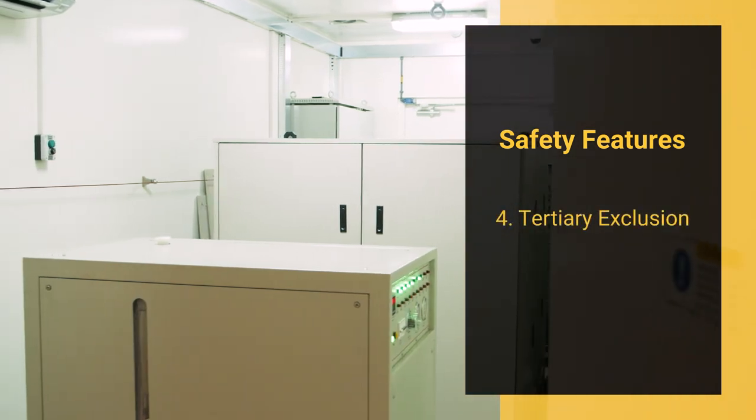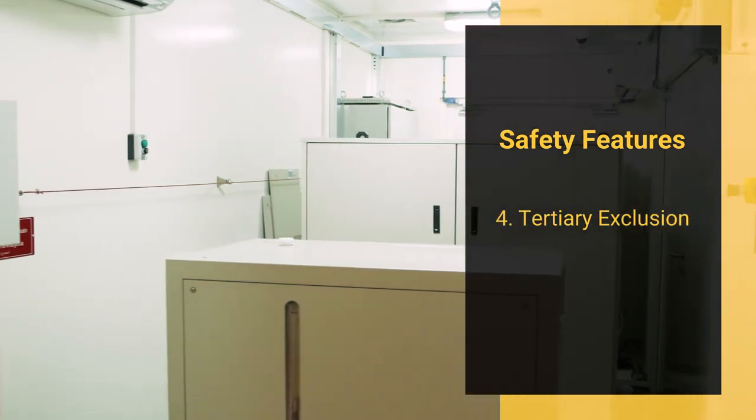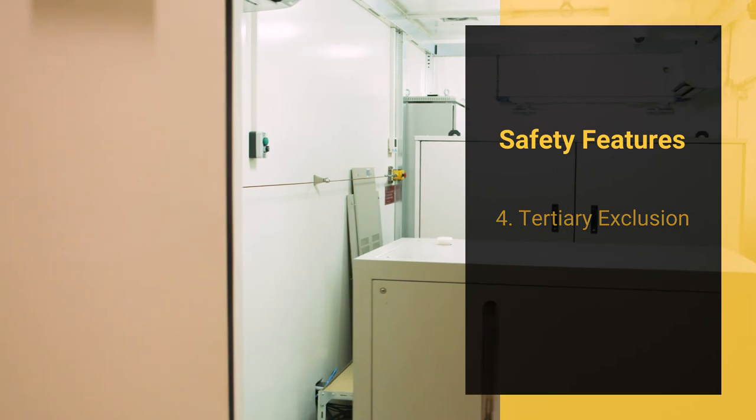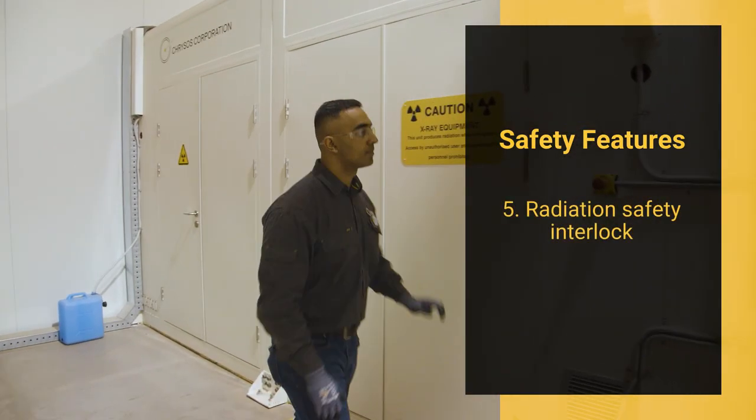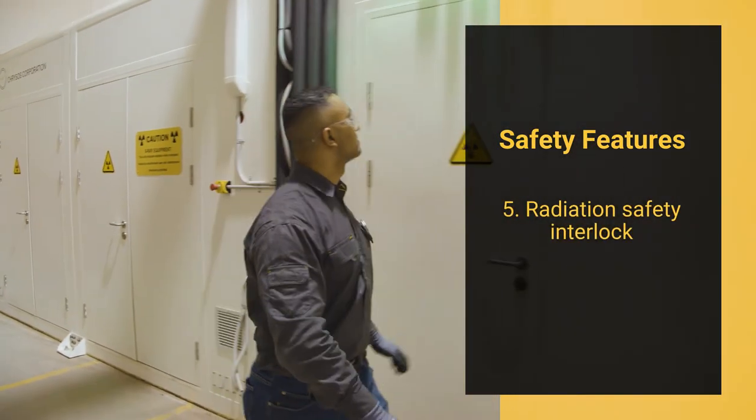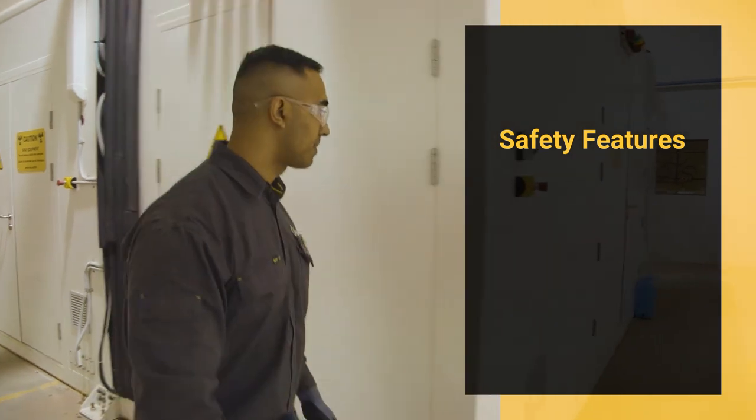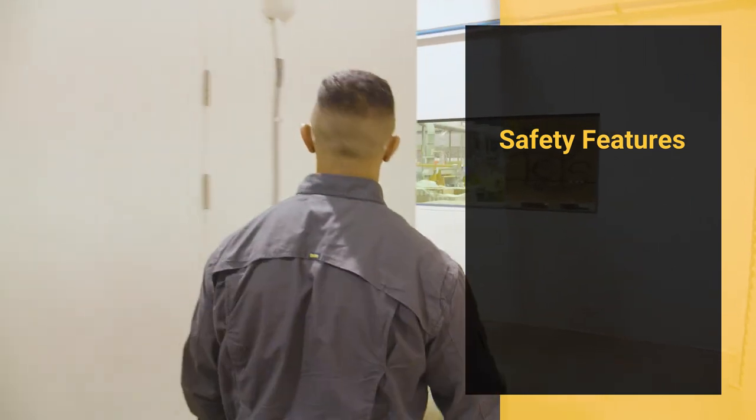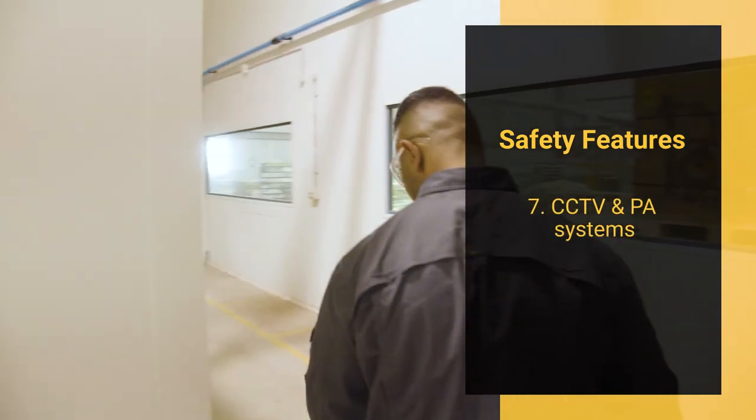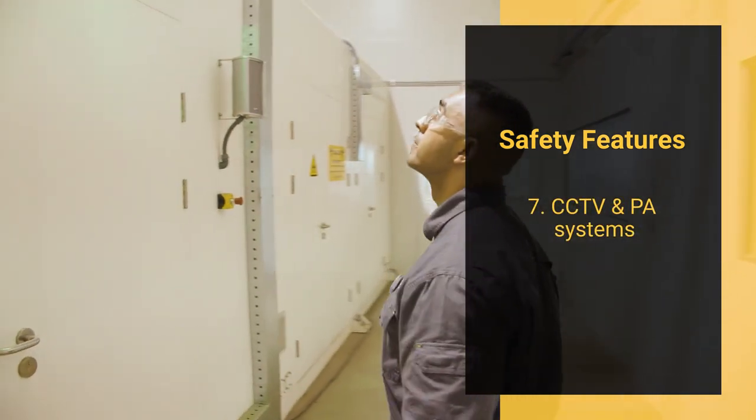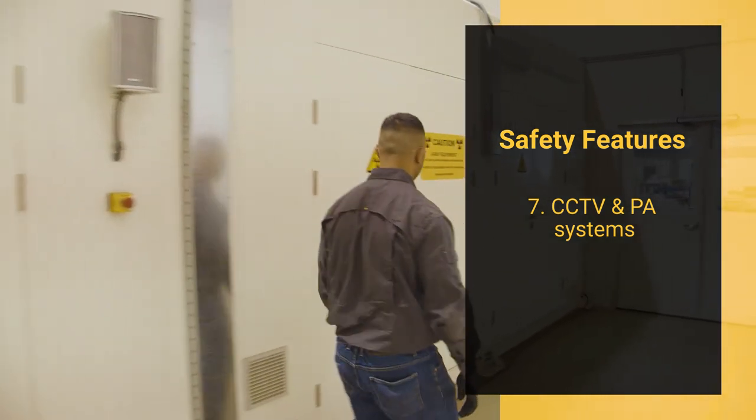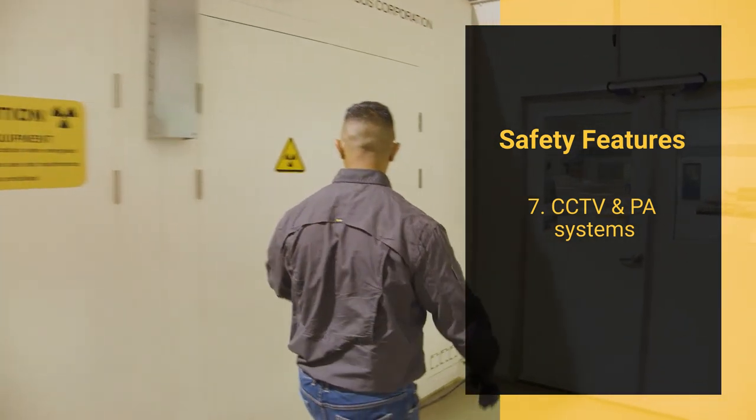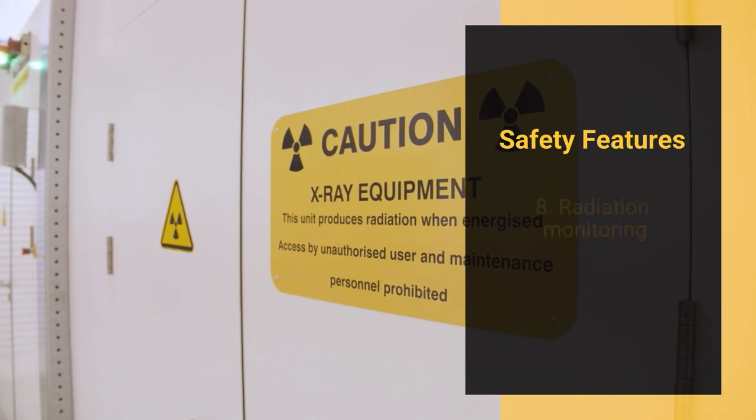For example, an arming sequence must be completed before the X-ray source is operable, and a safety interlock system stops unsafe running of the LINAC source, including the prevention of access to the cabins during system performance. The interlock system itself incorporates a series of key switches, emergency stop buttons, emergency stop pull cords, door interlock fail-safe switches, and a radiation area monitor.